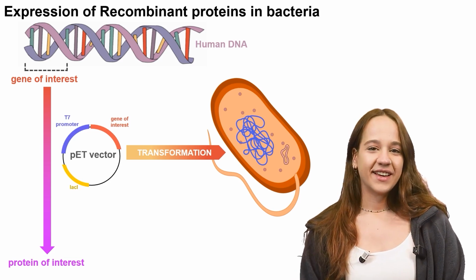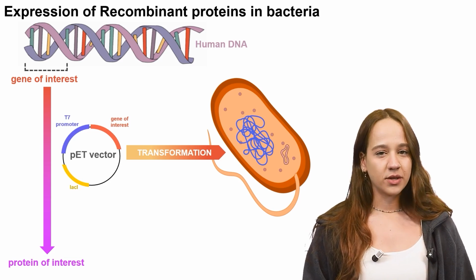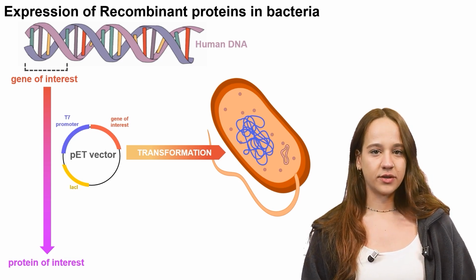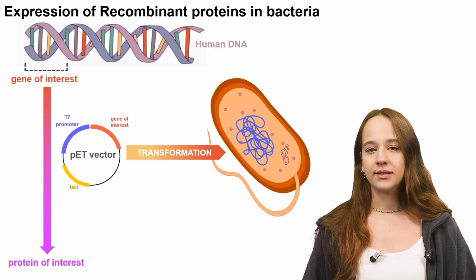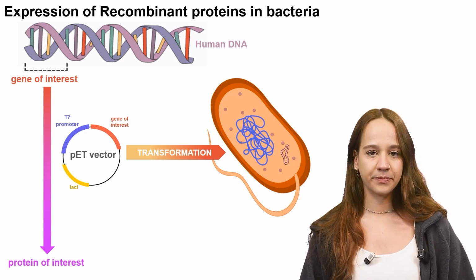In this lesson, I will introduce you to this process step by step, to go from the expression vector carrying our gene of interest to the bacterial cell pellet that contains our recombinantly expressed protein.